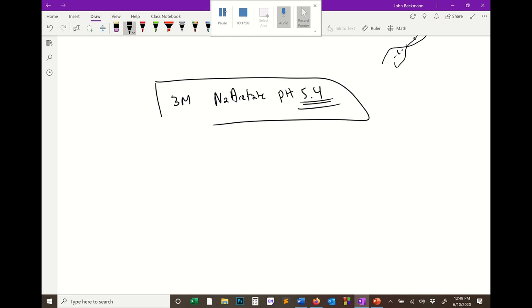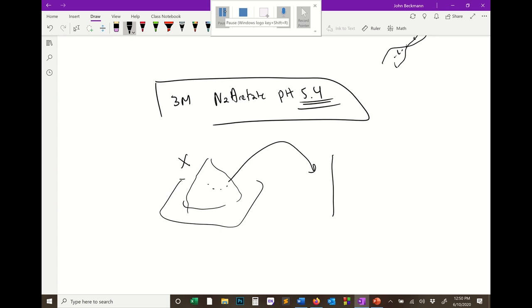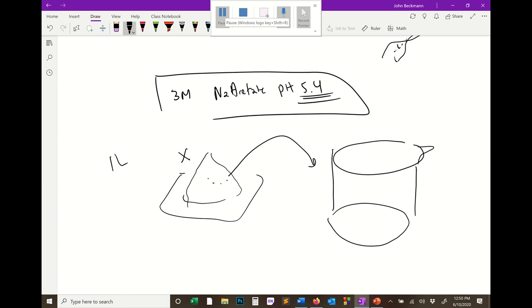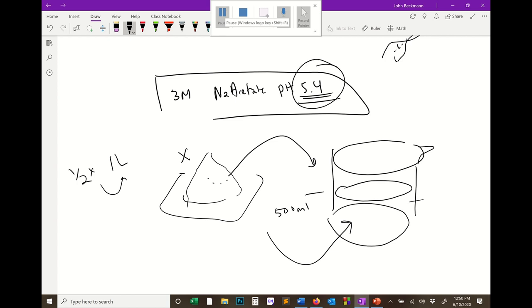Because what's going to happen is you're going to calculate X amount of powder to weigh out, and you're going to put this into a beaker. Let's say you're going to make 1 liter. You would only fill the beaker with 500 mils, which is 1/2 the final volume that you want, okay? And the reason you do this is because you know that when you put that powder in there, it's going to change the pH of that water. And the pH is not going to be exactly what you want it to be. You might need to adjust it, okay?